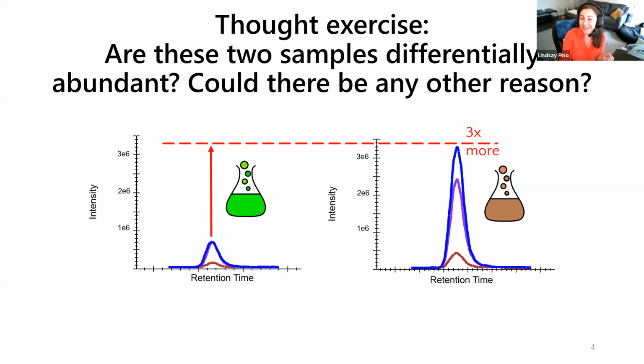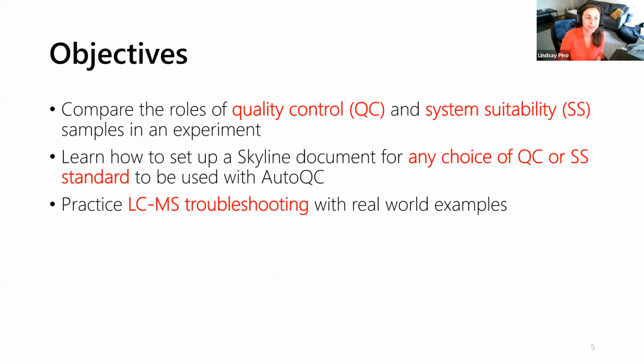What if it's the exact same sample run 2 times in a row? Could you get a different quantity from the same sample? I think a lot of us in here, just looking at the names popping up in the attendees, yes, we absolutely know that there are many reasons you might get a different quantity, even if you run the exact same sample multiple times.